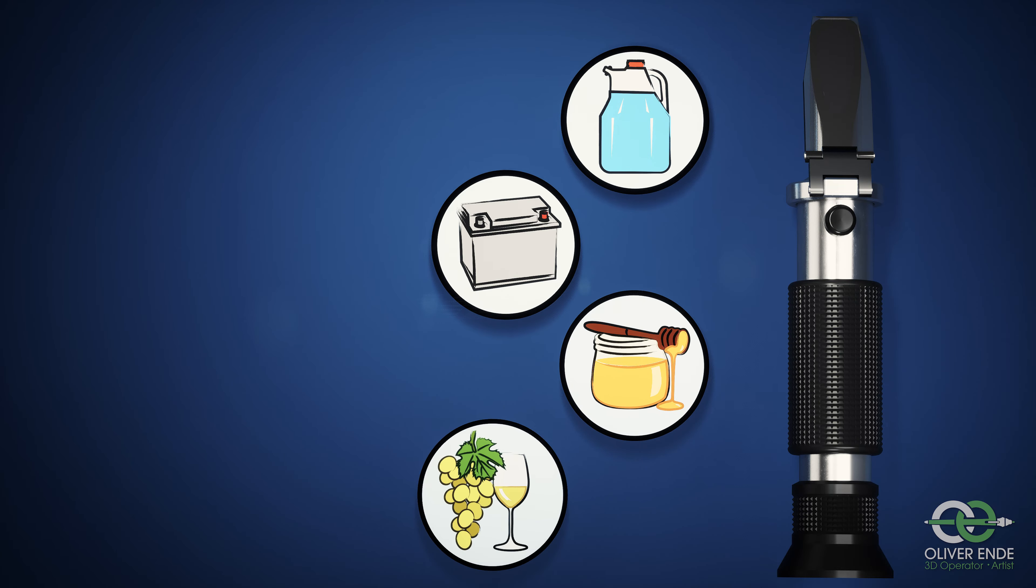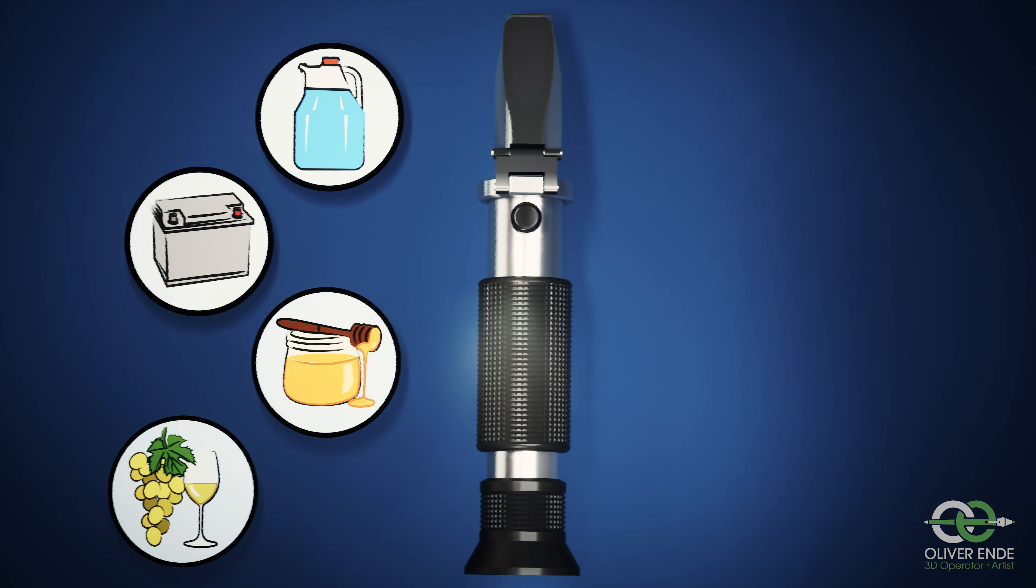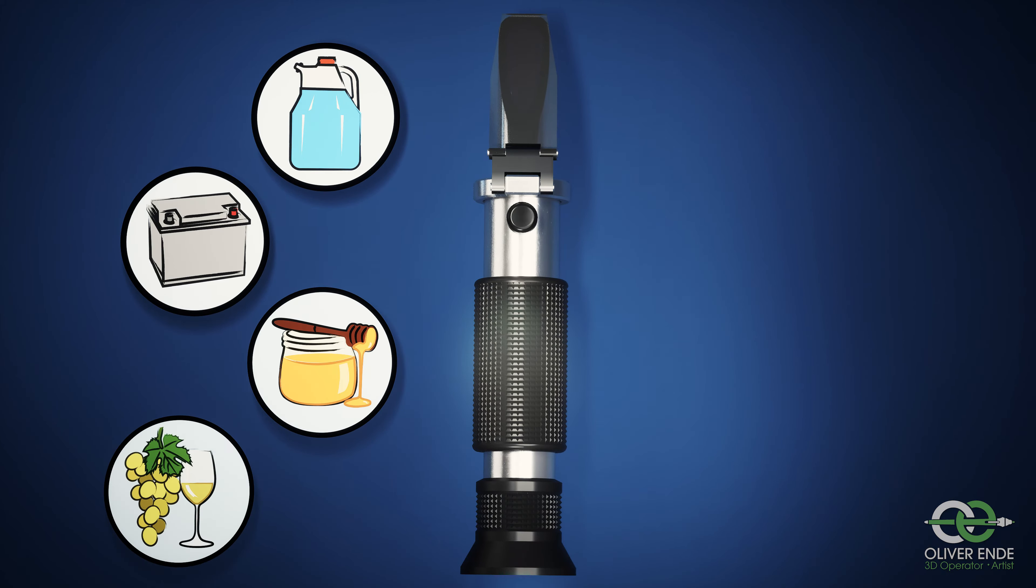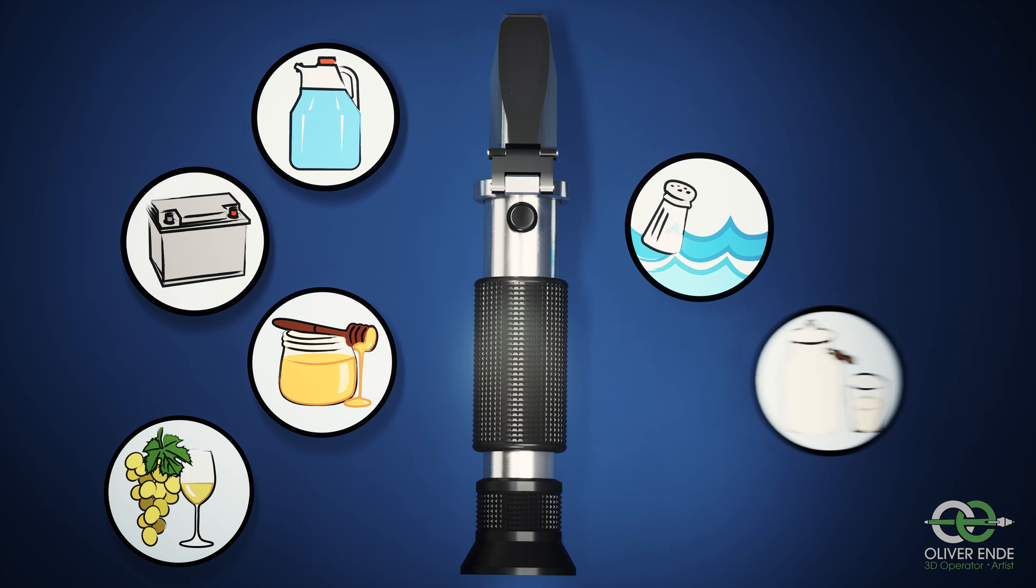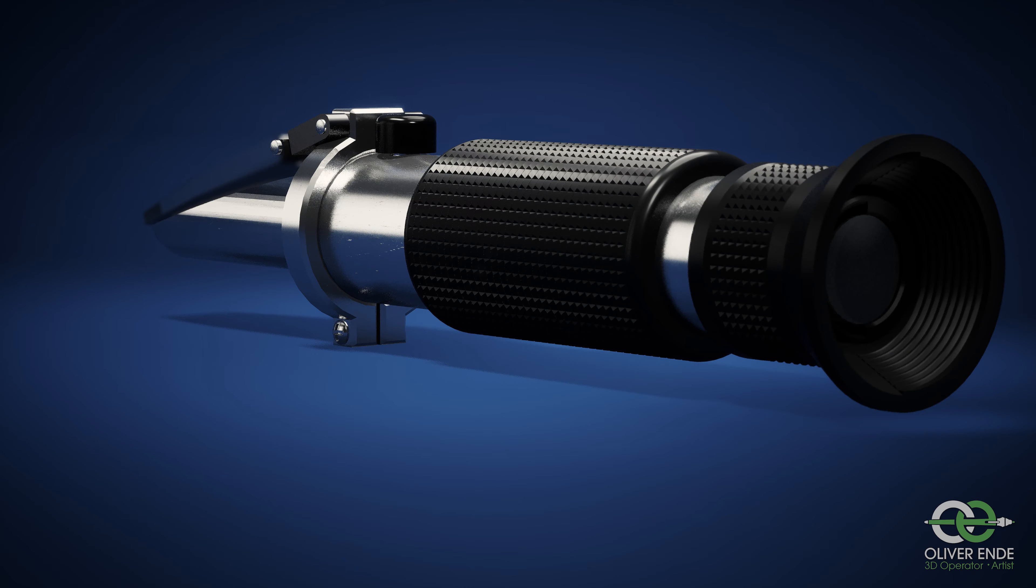However, it is also used in other areas, for example to determine the salt content of seawater or to measure the water content of cows, goats, and sheep's milk.